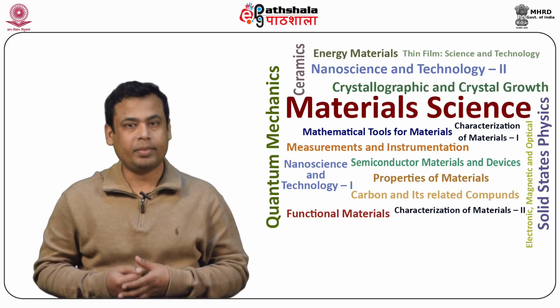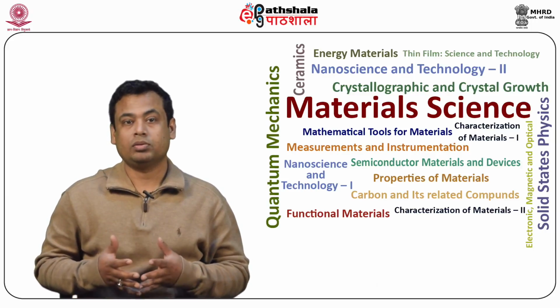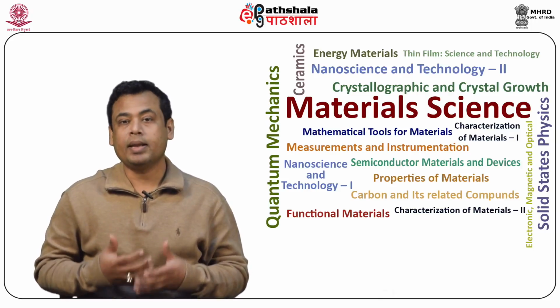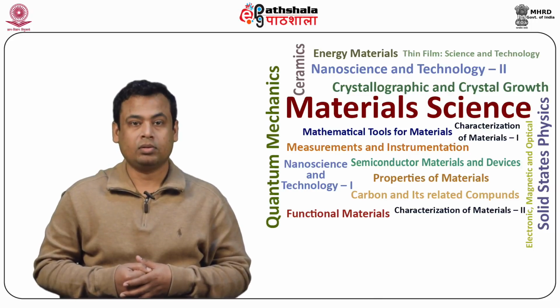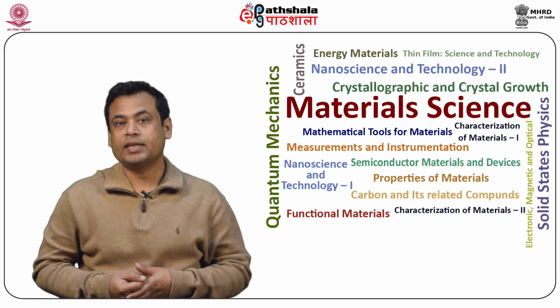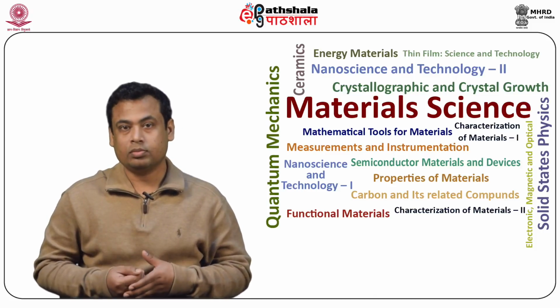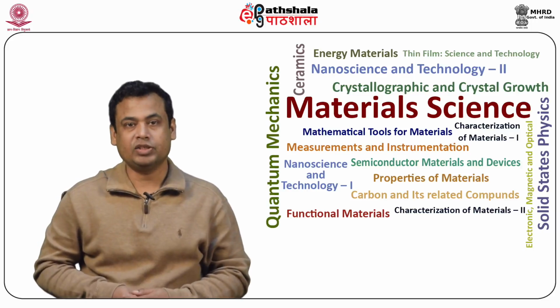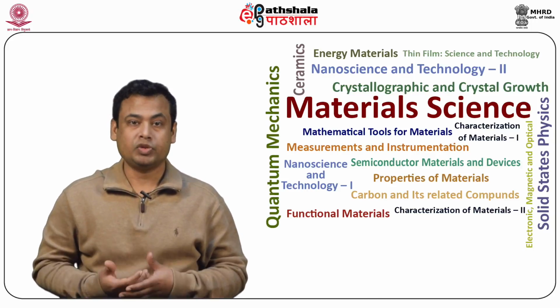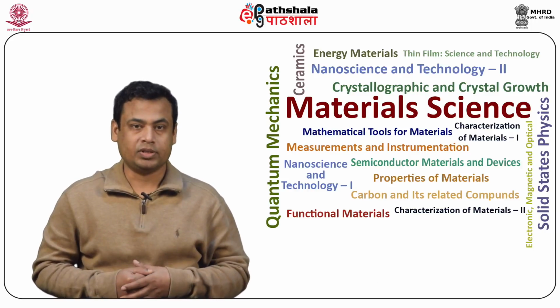These features make fluorescence spectroscopy an attractive technique as compared to other forms of optical spectroscopy or other analytical techniques such as chromatography and electrophoresis. Fluorescence spectroscopy has been used widely as a tool for quantitative analysis, characterization, and quality control in the pharmaceutical, environmental, agriculture, nanotechnology, and biomedical fields.